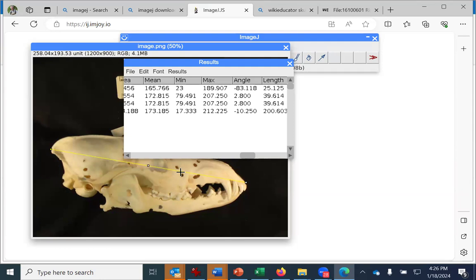And so the same is true for your microscope slides. It's a little better with microscope slides because you could in fact calibrate for, let's say, your 20x lens. And you could fairly reliably get good accurate measurements from several photographs using that same lens. In this application with the big, large objects, something as subtle as a change in the focal length, distance from the camera, or zoom that the student used to take the photograph, all of those things could affect the size. So things are actually a little better with a microscope. But yeah, that's what I've got for you.